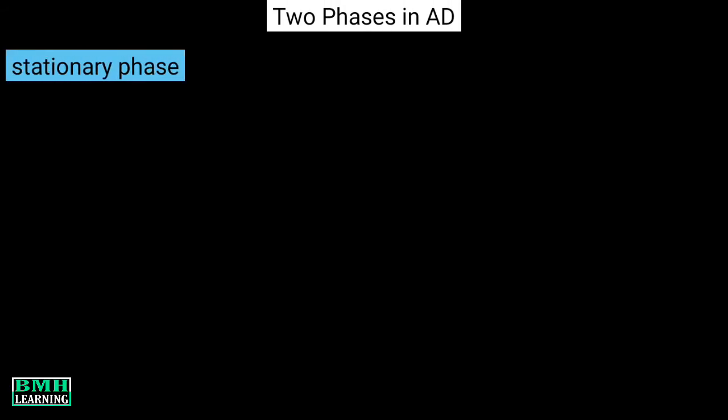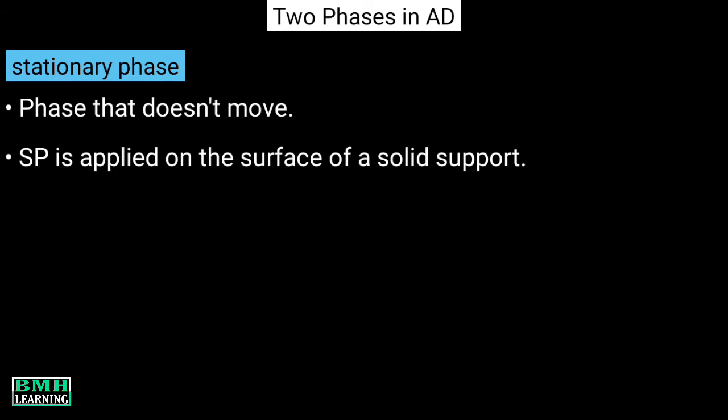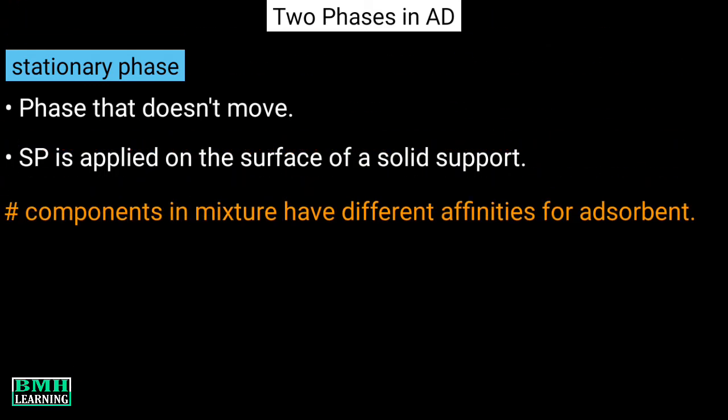So we have the stationary phase. This is the phase which doesn't move. And generally, the stationary phase is applied on the surface of a solid support. The components in the mixture have different affinities for the adsorbent.